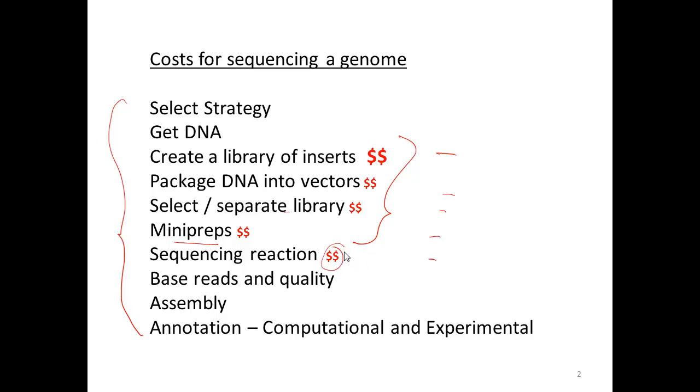The 5th step, the sequencing reaction, the costs have been reduced by miniaturization and multiplexing. You still have to pay for enzymes and nucleotides, but if you use smaller amounts, that's one way of saving cost. And if you can perform millions of reactions simultaneously rather than 1 tube at a time, that also leads to tremendous savings.